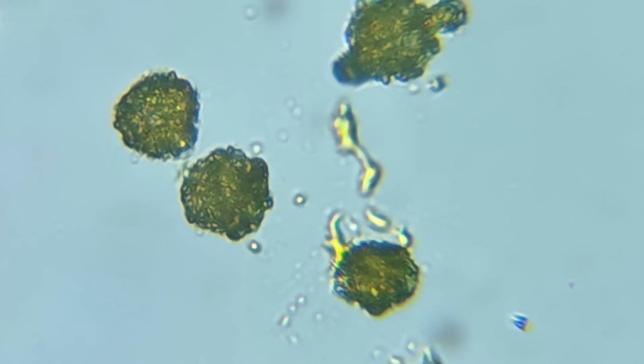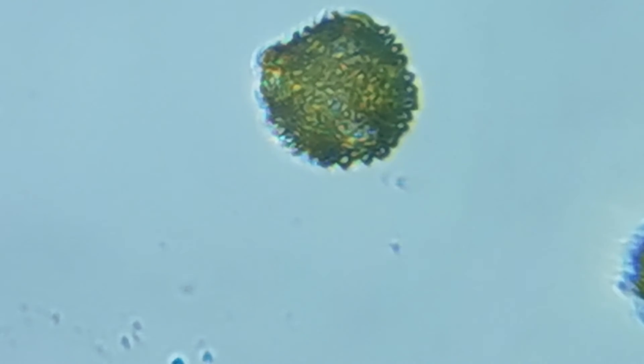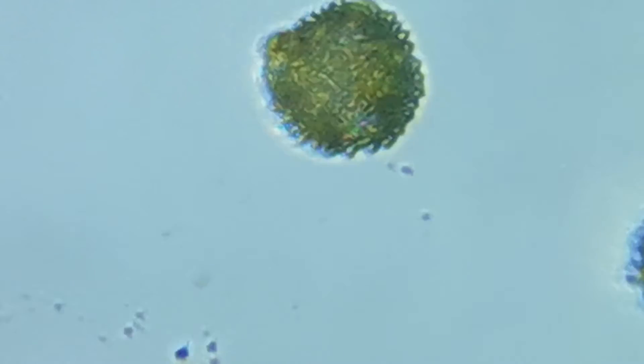There are many types of pollen, all different depending on the flower from which they are extracted. Try to experiment and you will discover an amazing world.